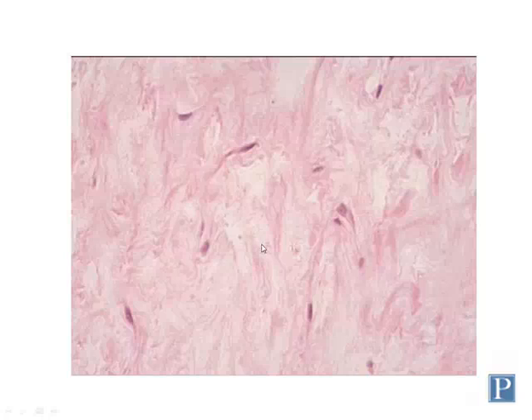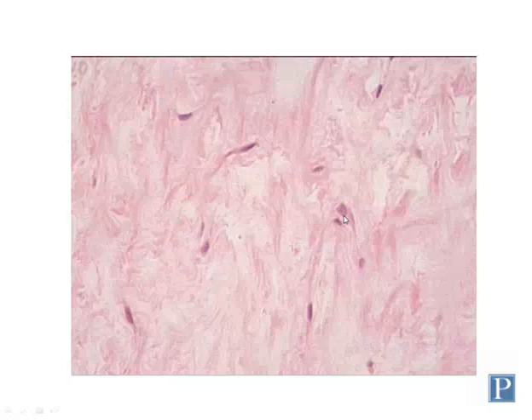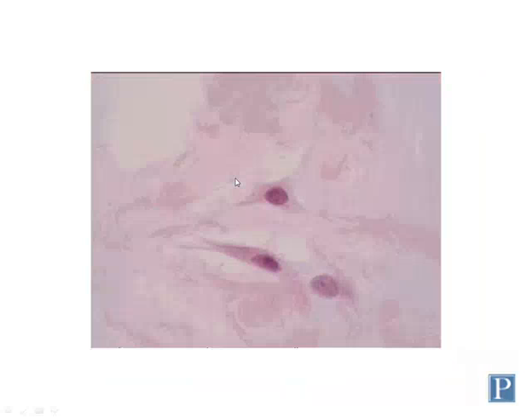Here's connective tissue that is either developing or has been damaged, and so many of these fibroblasts have transitioned from an inactive or quiescent state to an active state. And active fibroblasts have a different morphological appearance. Note that their cytoplasm is more full. The cells basically enlarge. They upregulate genes to help to repair or develop the matrix and are much more active, and so their cytoplasm increases volume to reflect that increased activity.